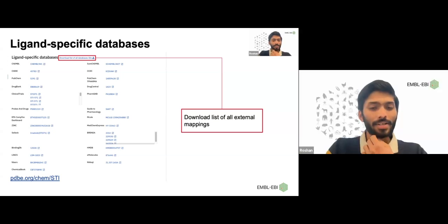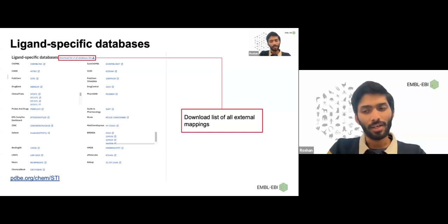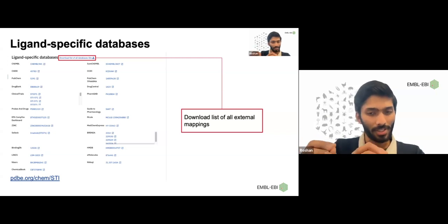So those interactions we have shown here are computationally calculated. These are not particularly what is reported in the paper. At the moment, in the PDB entry pages, they are not available, even if some interaction is reported by the crystallographer, let's say observed in the paper only. All the calculations and statistics we show are based on the distances between atoms, based on the 3D coordinates. These are all computationally calculated.